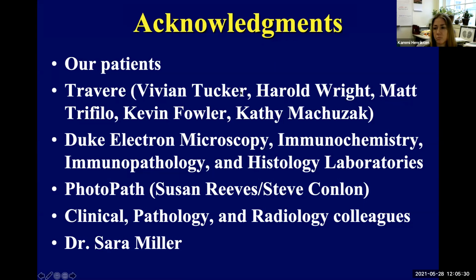I will say one important thing to recognize that I didn't really mention, although I sort of mentioned it in passing, is that for all of the 3 studies, not only light microscopy, but also immunofluorescence and electron microscopy, we do a light microscopic stain and section to look at the tissue. I showed you an H&E stain on a frozen tissue block that didn't have any glomeruli. And we likewise look at our electron microscopy blocks using something called a semi-thin survey section stained with toluidine blue. And these things are good quality histologic sections.